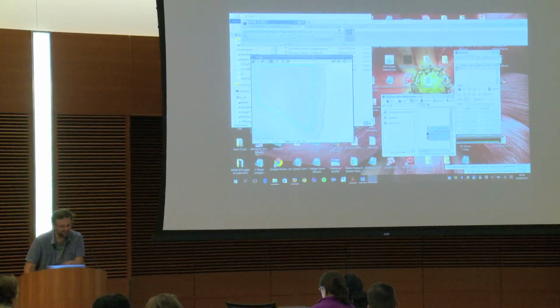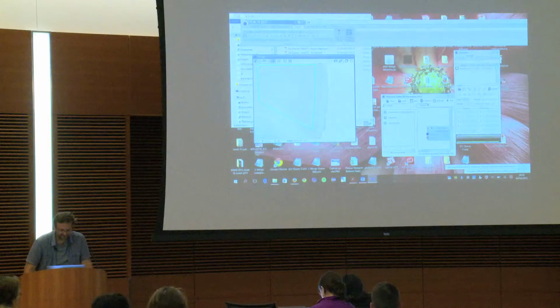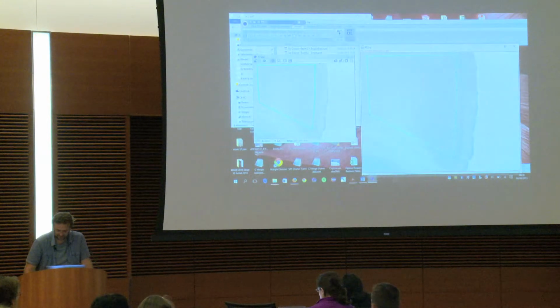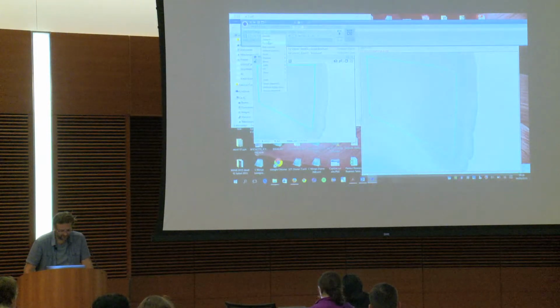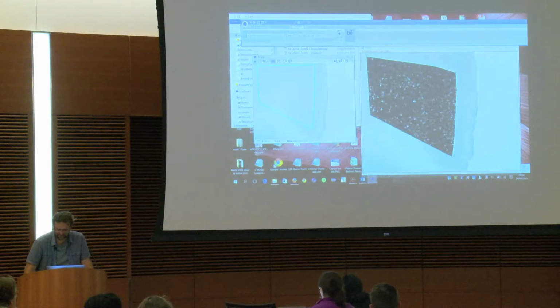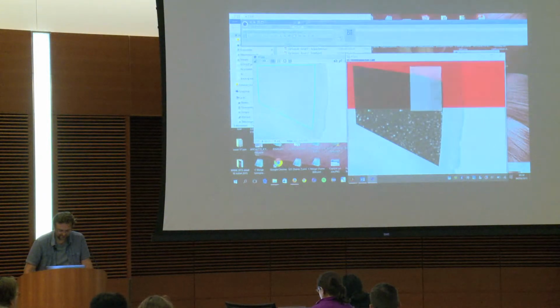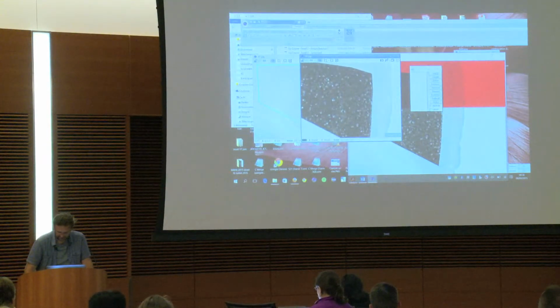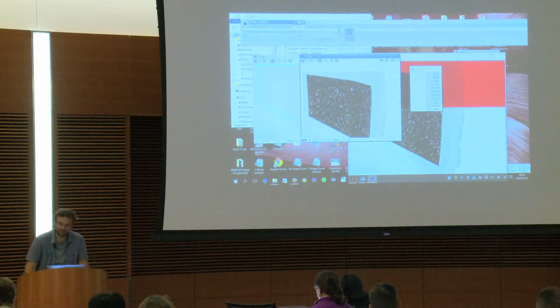And by the way, you can play with ICY this way, if we have several screens. And then you say, I want to do something in ImageJ with this. So convert to ImageJ, and now you are 100% in ImageJ. And you can do whatever you want, like find edges, okay. And when you're done, you click here and you're back to ICY. And I don't understand why I don't have the ROI. I should have the ROI back here too.